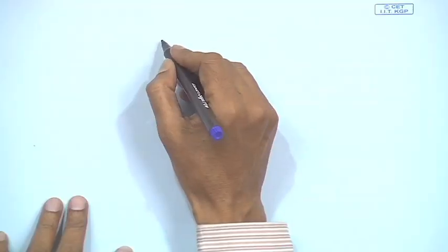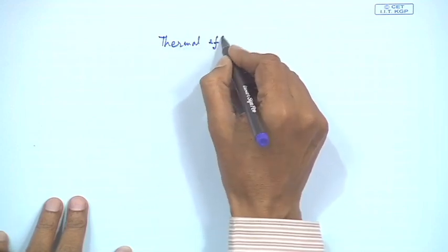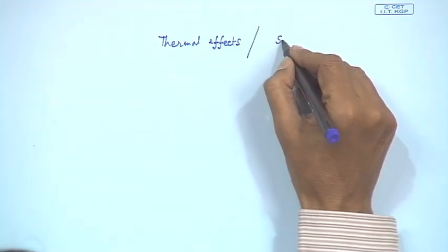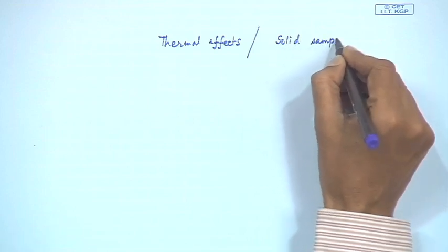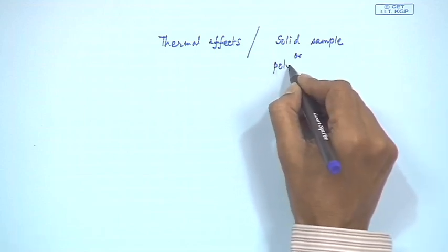Hello, welcome to this class of thermal analysis, where we are just seeing the thermal effects on some samples, which can be your solid samples or something else, can be a polymeric sample also.